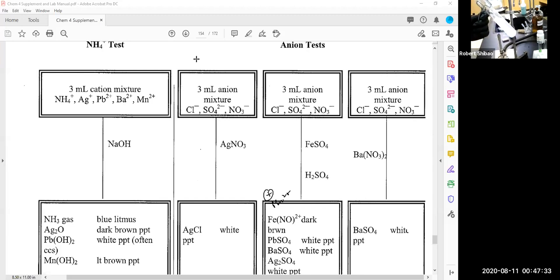So let me add a little bit more just to be sure. Again, it's not really turning cloudy. I'm just getting turbidity. Let me hit another spot. Okay, so I don't see any more cloud formation, white cloud. That means I precipitated out all the silver.